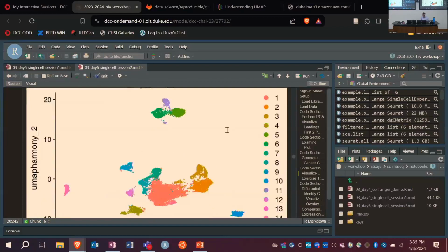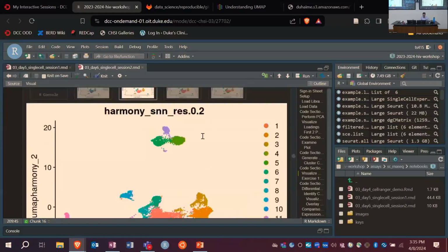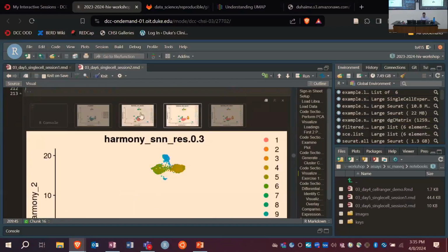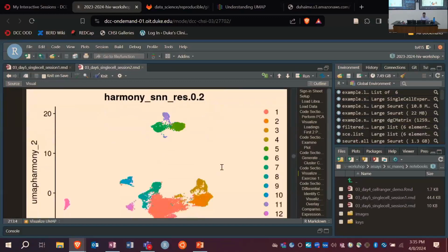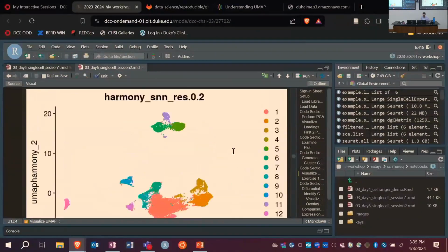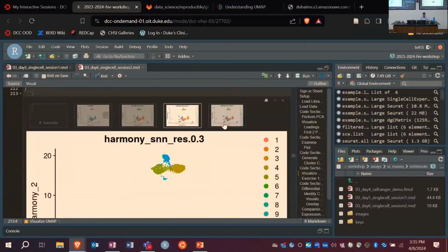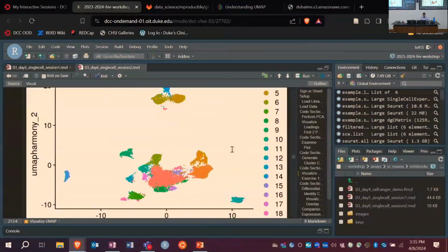And then the different clustering created by the different values for resolution for the Leiden algorithm. So 0.2 looks like it does a pretty good job of keeping separate clusters colored separately, or identified separately, according to the algorithm. So I think it's probably good practice to choose different resolution parameters and see what makes the most sense.